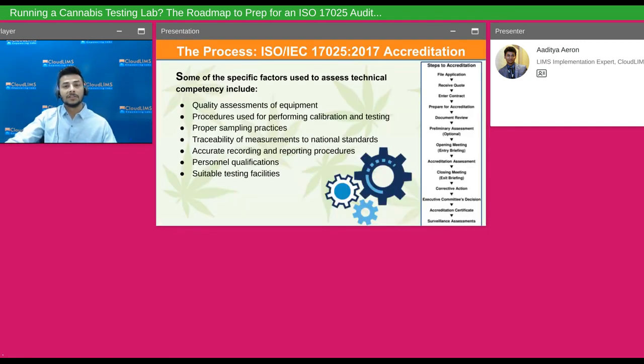With a little more detail there. Your first step becomes for your quality management system documentation to be gathered. You can then share it with the ISO accreditation body, let's say A2LA, for example, and then they will review your documentation, basically your equipment that you're using, the technical processes that you've put in place, or your competence of the staff and the trainings that are conducted.